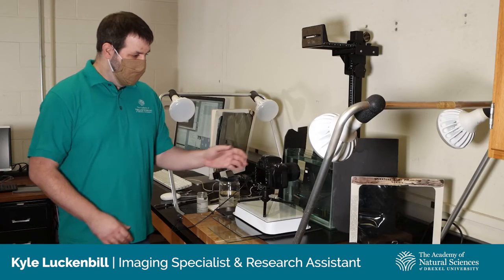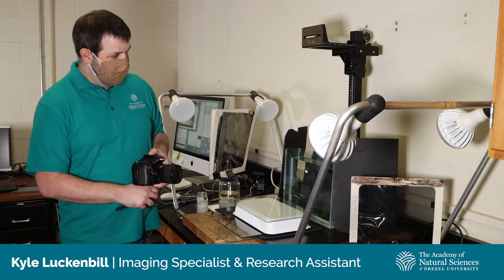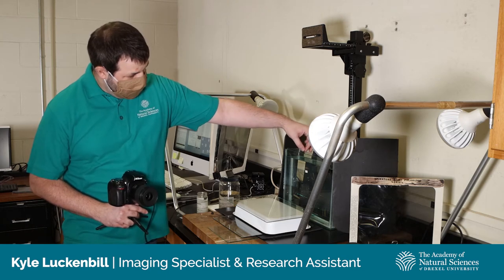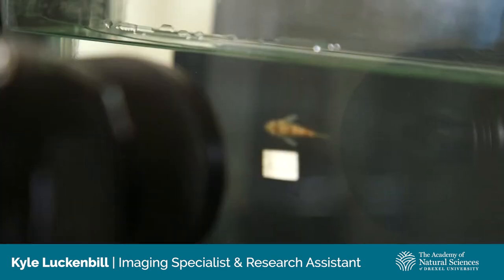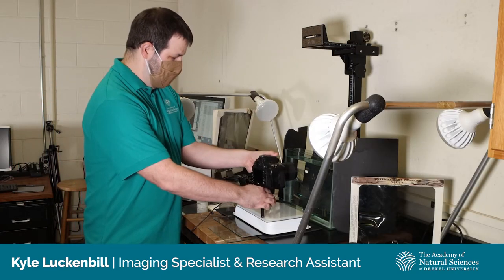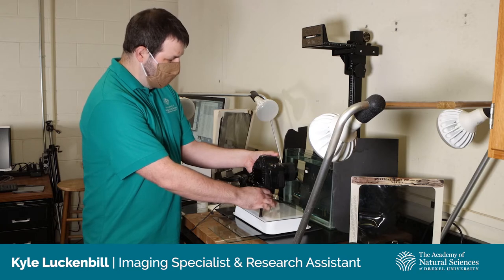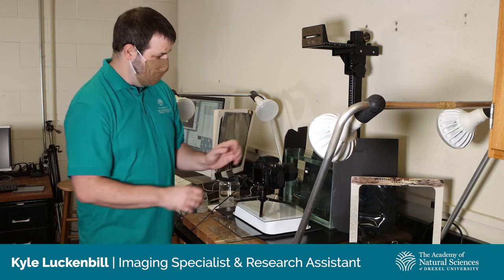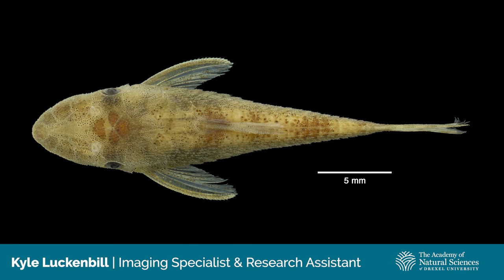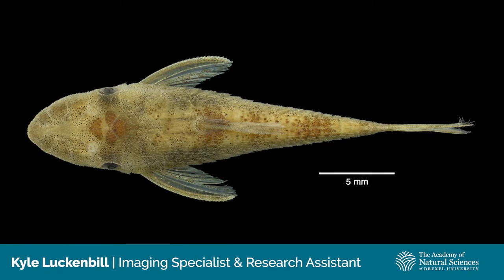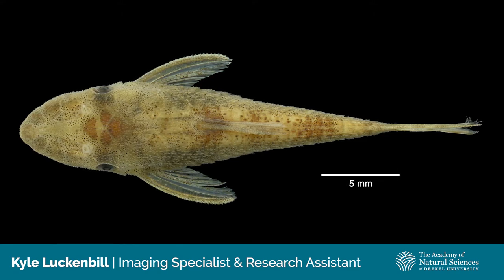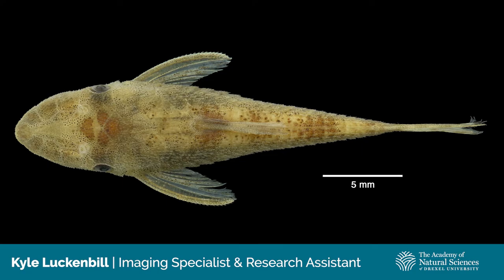Here I've got set up one of these tiny little fish in a squeeze tank. This is a tank filled with water. In the tank is a small pane of glass that actually squeezes the fish against the outside of the tank. Then we can set our camera up and get fairly high resolution photos with just a simple lens like this one. What we do is we usually do a dorsal, ventral, and lateral shot of the specimen. Sometimes if there is a specific request — like a closeup of the mouth or the dorsal fin — we'll shoot that as well.